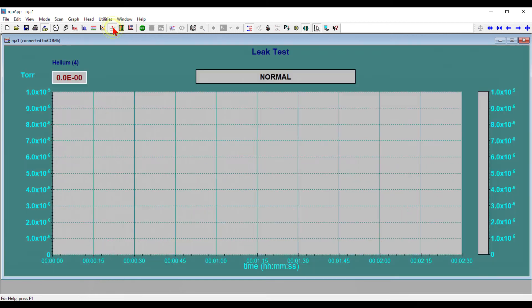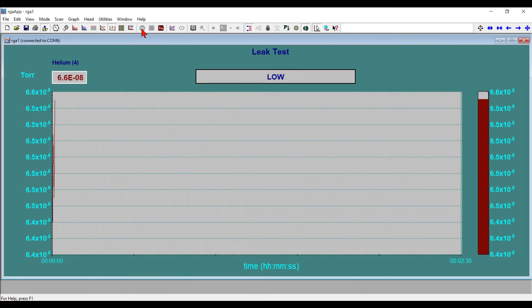If the leak was in the 10 to the minus 2 or 10 to the minus 3 torr range, you'd want to use isopropanol or methanol to find the leak. Now let's put the software in the helium leak check mode, where it will display the relative level of only the helium peak.